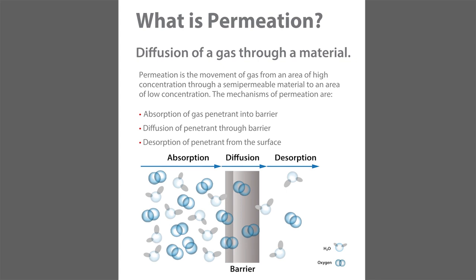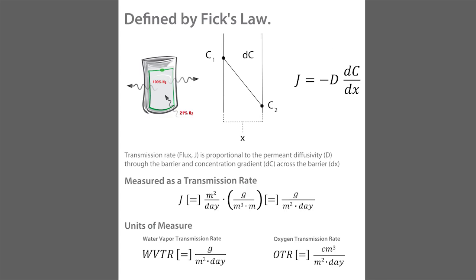So when you look at the polymers used for bottles, you might see them lightweight the polymers, make them thinner for things like water. However, if you have a really thin bottle for a carbonated soft drink, it's not good enough. You lose the carbonation just so quick through that thin structure. So the bottle wall and the thickness of the material does impact the net transport and net transmission rate of CO2 through that bottle. There's physics behind it. It's not just a made-up fact. Fick's law is known to really kind of control or define what's going on with things.